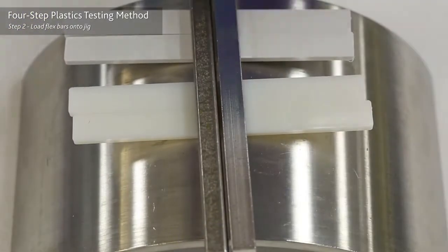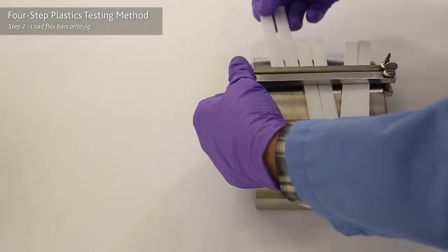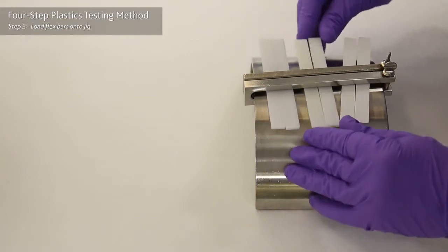Step two: load the plastic flex bar onto the jigs. Remember to load control samples that were not exposed to chemicals.